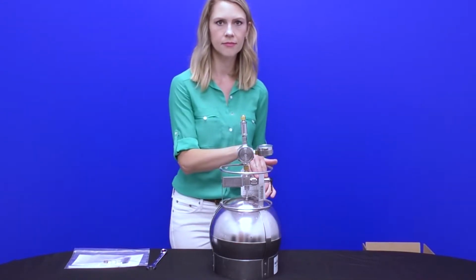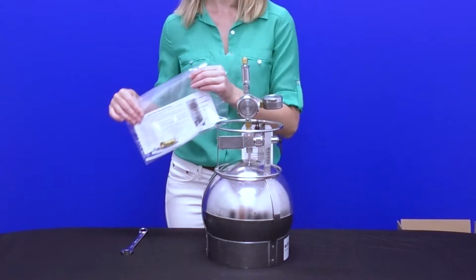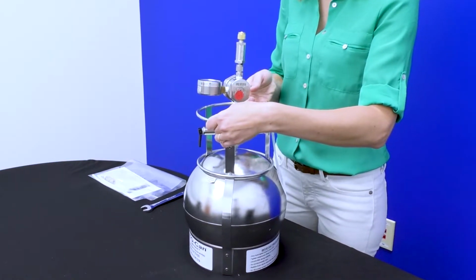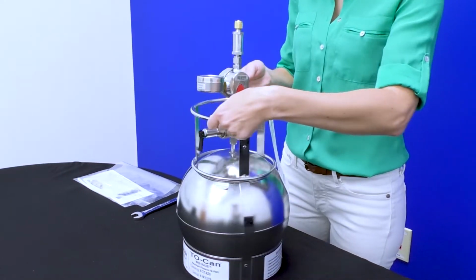If tubing and fittings are needed for subslab or soil gas sampling, you will find these items and all instructions in the enclosed plastic bag. If collecting samples with different flow controller settings or durations, confirm you can clearly identify which is which.